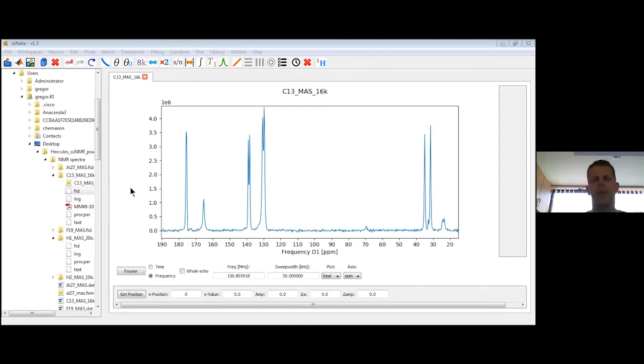So phasing, baseline correction. Then sometimes the spectrum can be very noisy, or the time domain signal can be very noisy. And it's useful if, at the end, we cut out this noisy part that doesn't bring any information about the oscillations. We do this in practice by applying a windowing function or by doing apodization.